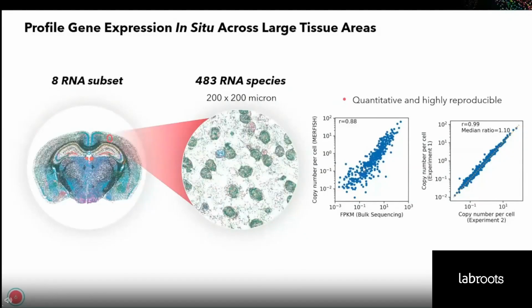In addition to generating quantitative data, we always want to make sure that that's highly reproducible. As you can see here, two technical replicates. If we look at that correlation, it's very high at 0.99.